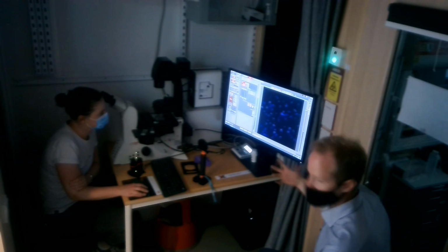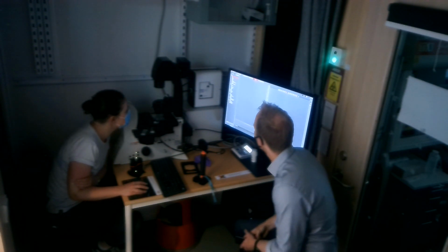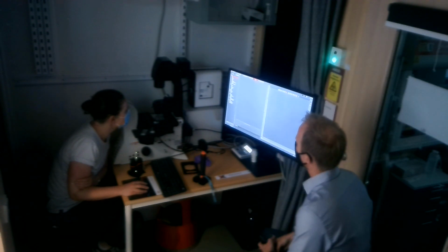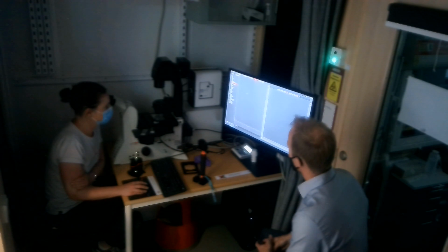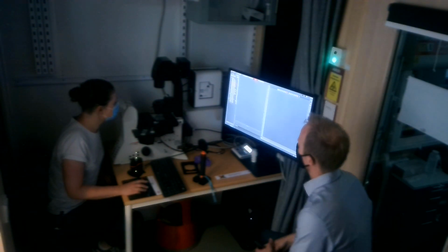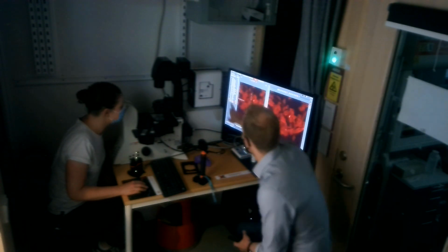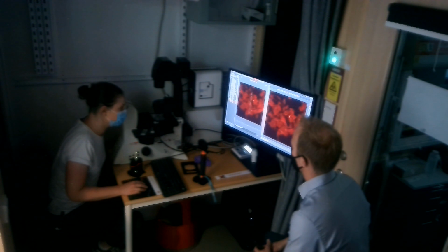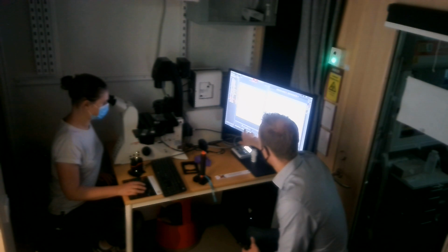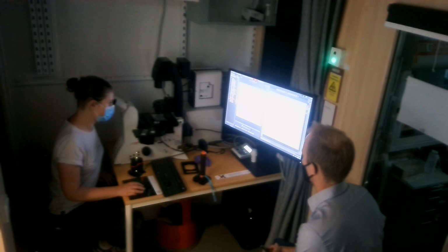If you want to create this image, you go into Process, and you have, let me see, which is it? Projection. Up a little bit. There. Click on that one. We have to select an image. Right now we have no image selected, so if you go to Open Projects and you find your image, we have a lot of random stuff now. Normally it puts it at the end. So here we have the set stack, right on top. Now you have a projection, use the maximum, and you can do apply.